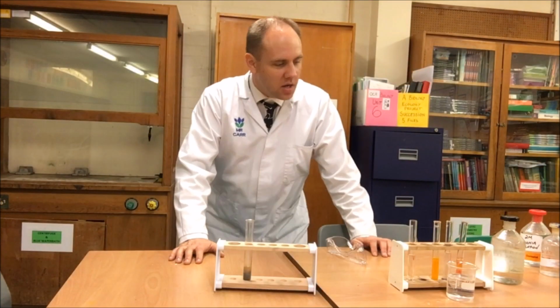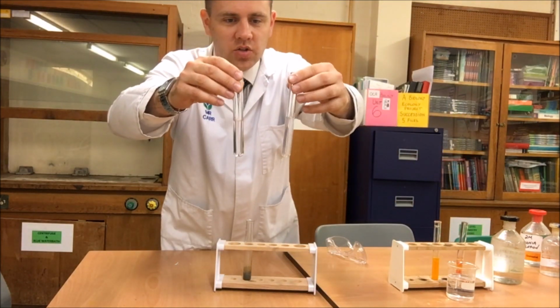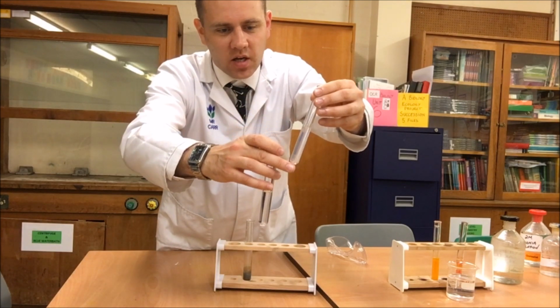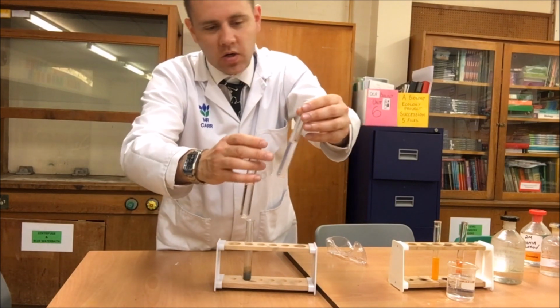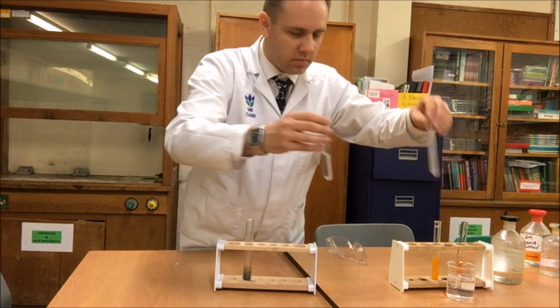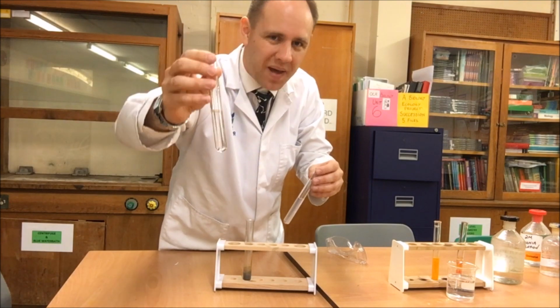All right, ladies and gentlemen, what I have done is I have allowed the Tollen's reagent to continue for far longer than was necessary. What we should have seen with the aldehyde, i.e. the glucose, is a nice silver mirror effect. Unfortunately, this has not worked, perhaps because the ammonia that we've used is a bit old and we need fresh ammonia. The other one, which is from the acetone, has not worked either, but we expected this one not to work.